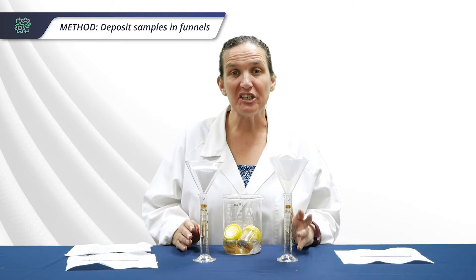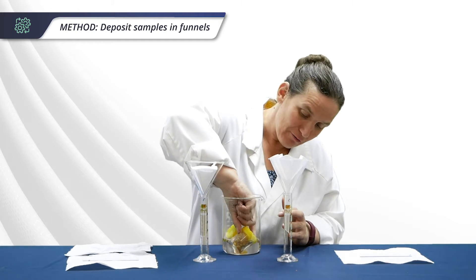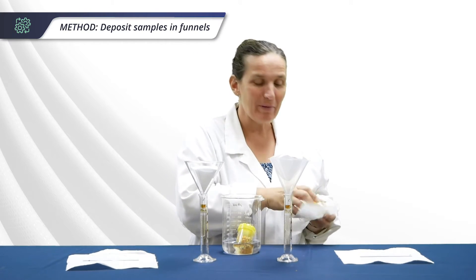After the 15 minutes incubation is over, take your samples out of the water. As you can see, my vials have fallen over in the bath, and that's why I prefer to use vials with lids rather than beakers with parafilm.